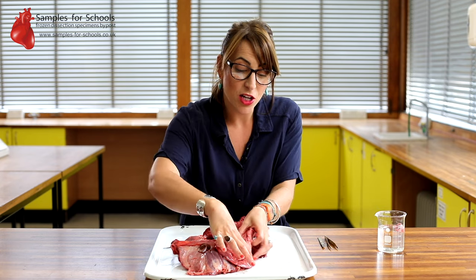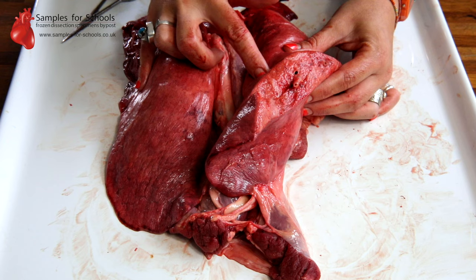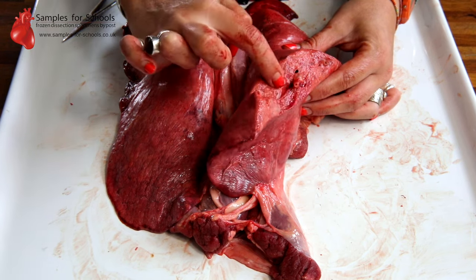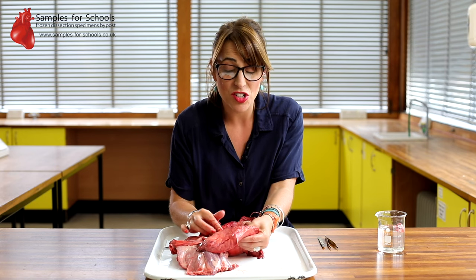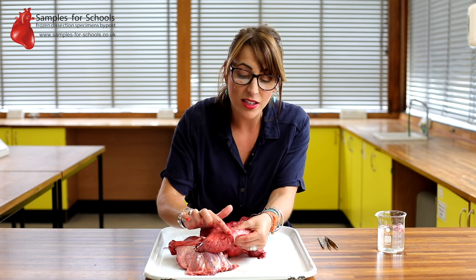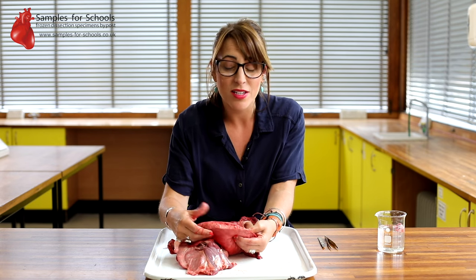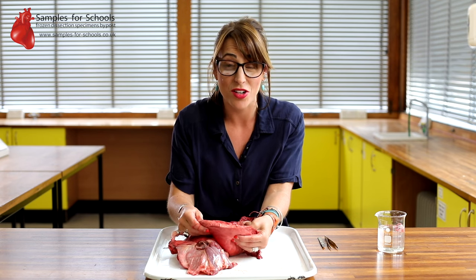If we look back at the lobe that we took it from, you can see the ends of the bronchioles that connect to the alveoli, that transport the oxygen into those alveolar sacs. Now they are incredibly specialised for gas exchange. Those sacs are very thin, so there's a short diffusion pathway for the gases. And they are lined up against a huge, efficient capillary network, so there is a good blood supply to carry that oxygen away from the lungs and to the heart.